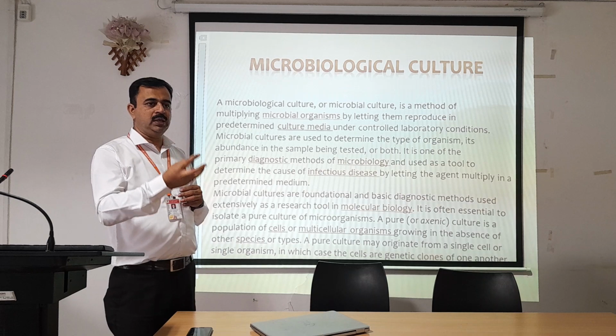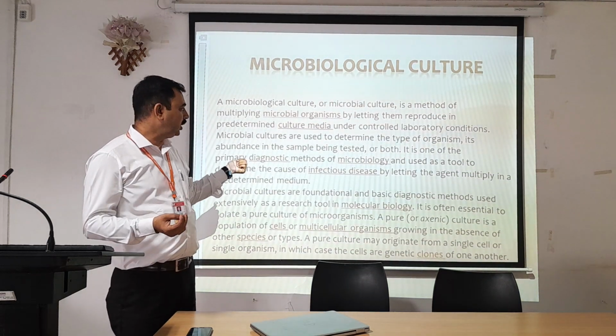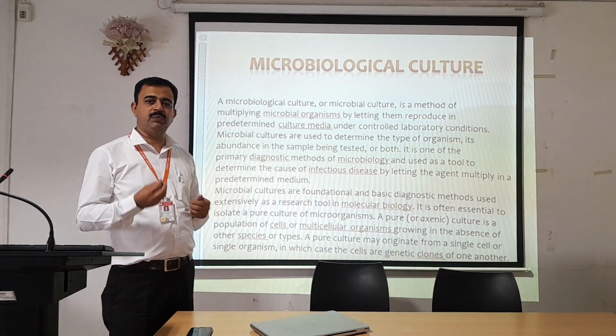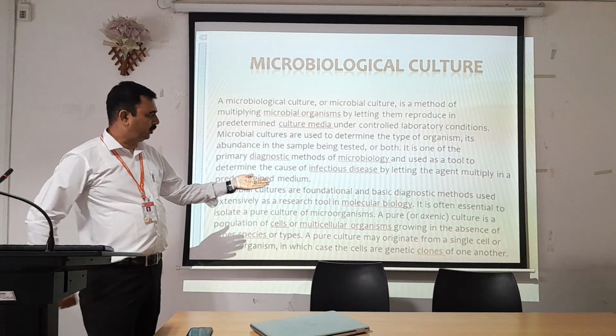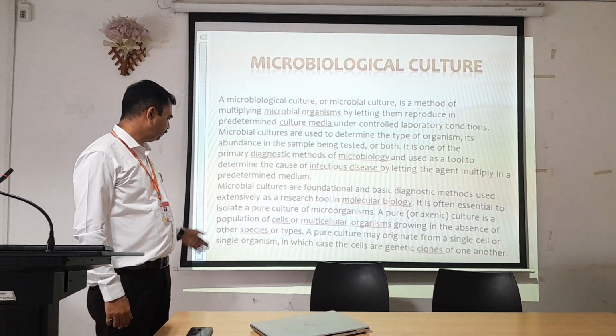So we will try to isolate the organism only for tuberculosis. For that purpose, we need a pure culture to be isolated, and therefore these kinds of methods are helpful. So microbial cultures are a foundational and basic diagnostic method.